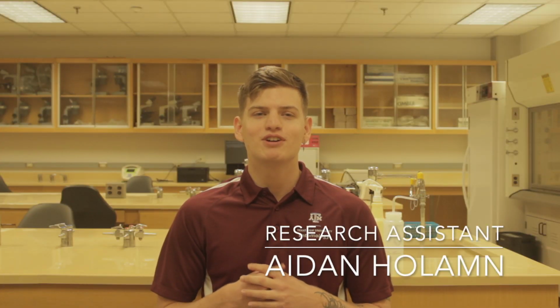Here in the Kurouski Lab, our forensics team is formed by students from diverse studies such as toxicology, entomology, environmental sciences, and, of course, forensic and investigative sciences. Our research spans even further in areas such as forensic entomology, forensic hair analysis, controlled substances within plants, and much more. For each of them, spectroscopic methods such as Raman spectroscopy and infrared spectroscopy are used to reveal, identify, and differentiate each specimen. Our research doesn't even stop after the paper is written.